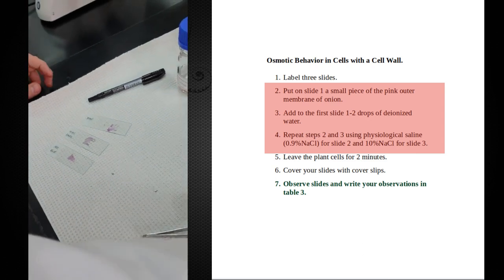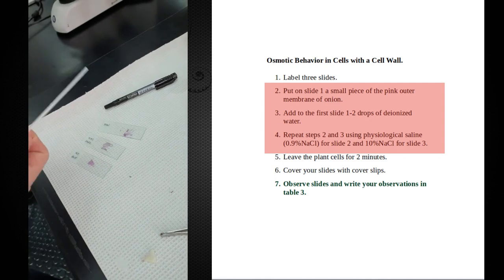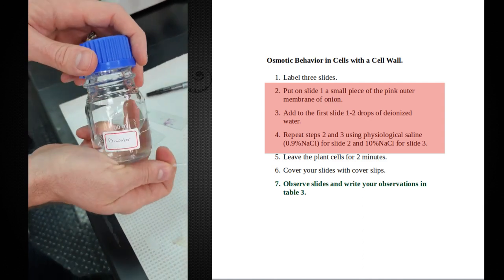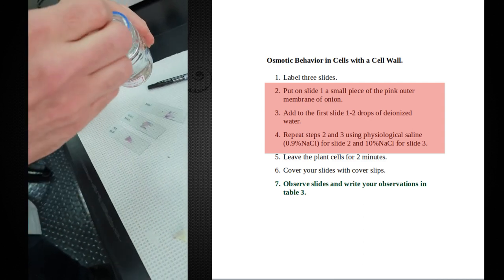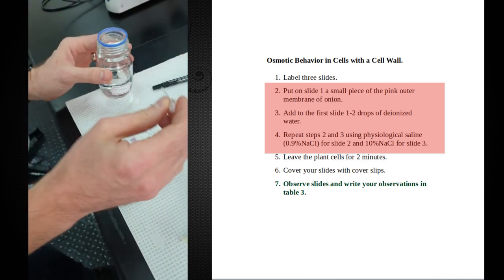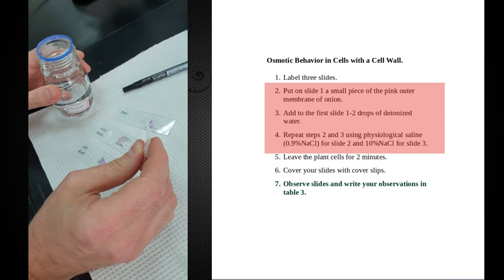So now we have different solutions here. We're going to have some distilled water. I'm just going to put a couple of drops. Well, really one drop is all we need probably on here.